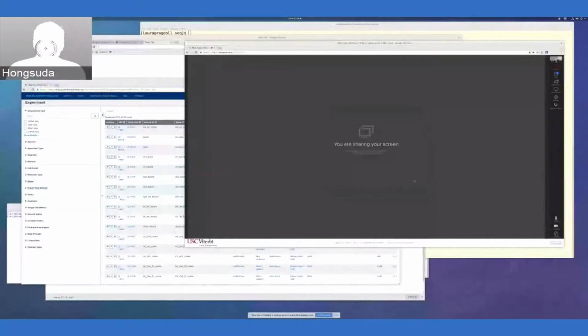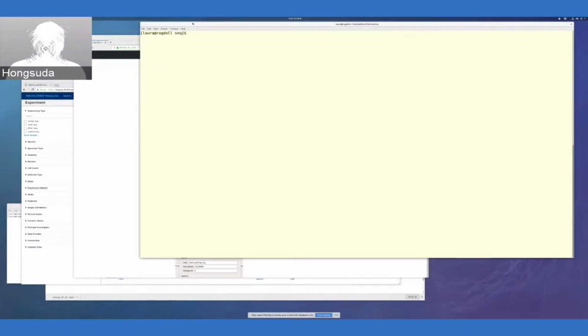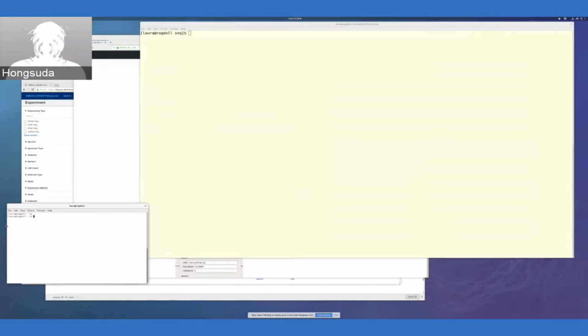So basically, if those are specific to each replicate or the single cell replicate, then you can just hook it up there, and it will show up along with the other sequencing data. But you can also submit at the study-wide level, as study analysis files. That's really like a dumping ground for arbitrary files, where you write the description and have them shown when you go to the study. So is there a specific address where we upload those to, or a button to push?